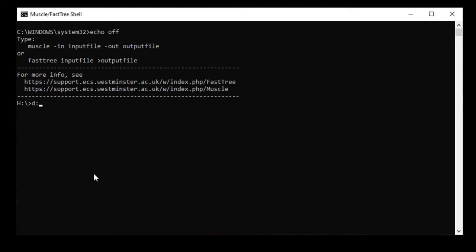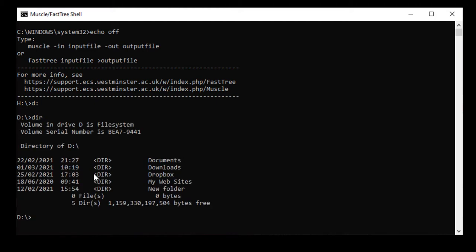Then I check that I'm in the right place using the DIR command, which lists all the files in the directory that I'm currently in on my computer. It shows that there are directories called Documents, Downloads, Dropbox, and so on.